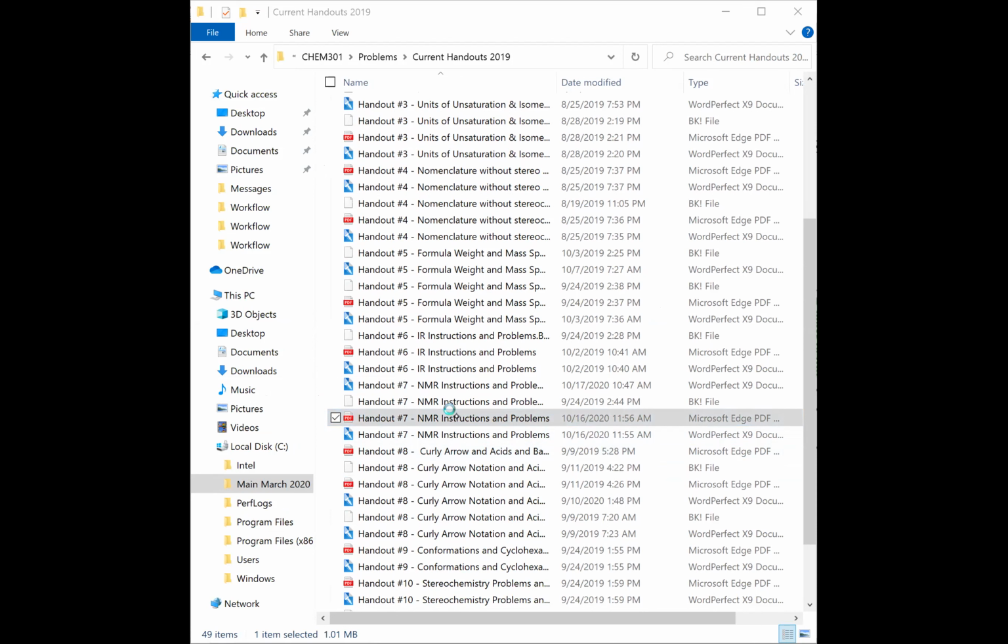Sorry about that. All right, so let's talk about what we do know. What can be found, of course: the number of peaks, the splitting. So everything I told you is right here, kind of in a summary. The integration. So the last thing I have to talk about is shift, but I wanted you to see some examples of what I'm talking about. All right, so I promised I'd come back to that benzene. I have drawn these for you on the handout.